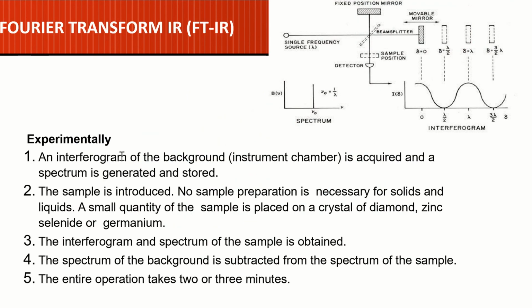Experimentally, an interferogram of the background or instrument chamber is acquired and a spectrum is generated and stored. The sample is introduced. No sample preparation is necessary. I don't know if you recall, when we were talking about the sample, it had to be dissolved or mixed with KBr, sodium chloride, for example.